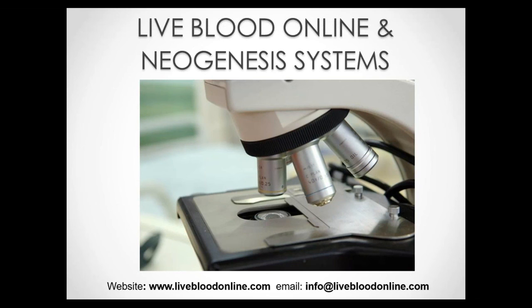Now, in essence, this is a nutritional test, so we can see various nutritional imbalances and other imbalances that can be addressed with changes in diet and lifestyle and specific natural treatment interventions. As I mentioned earlier, it's not really a tool used to diagnose medical diseases. The type of conditions that we're able to diagnose or detect with live blood analysis are in fact conditions that are understood in the field of natural medicine and not completely accepted in the field of conventional medicine.